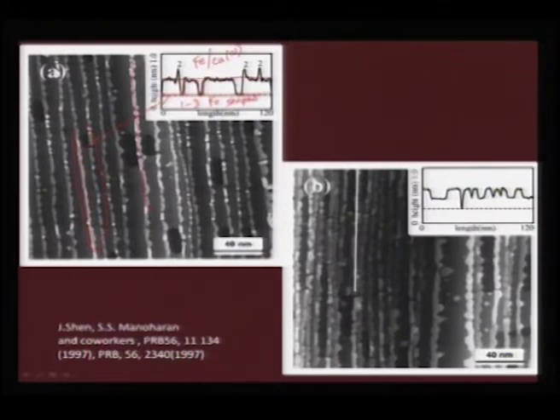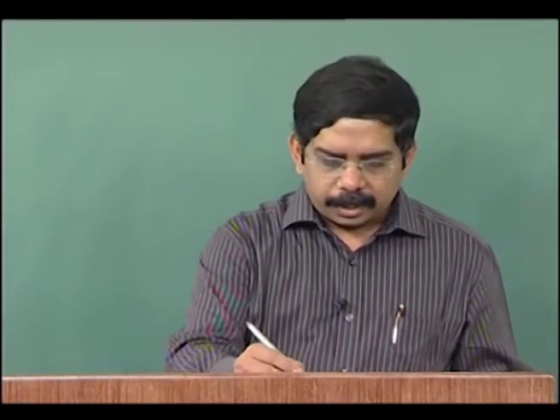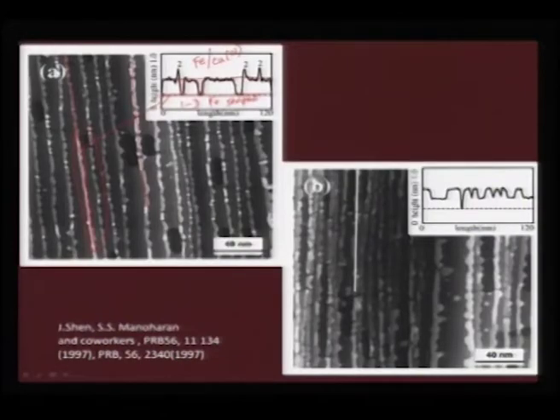So, then I can say it is a one dimensional wire, okay. But now it is simply remaining as a one dimensional stripe, but it can become a one dimensional wire, and as you would see here, the length of these wires can be as long as 1000 angstrom or 2000 angstrom, depending on the continuity of these stripes.